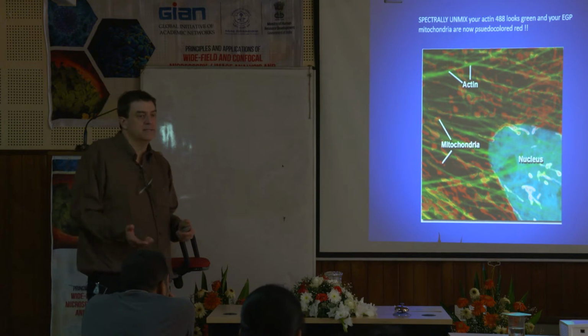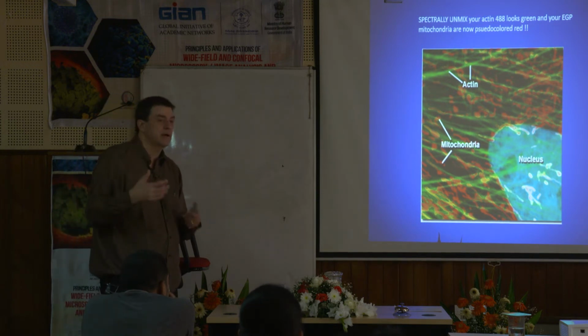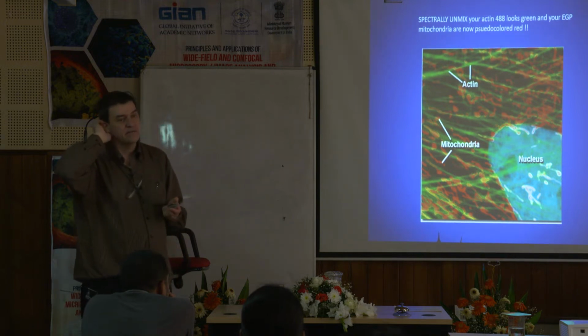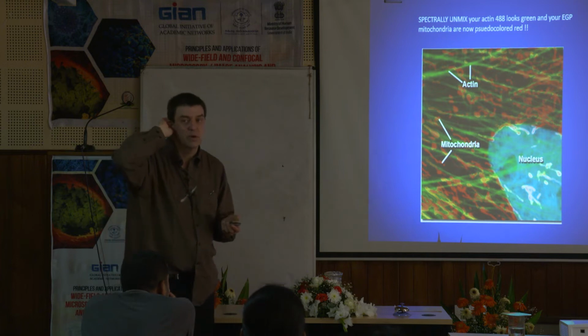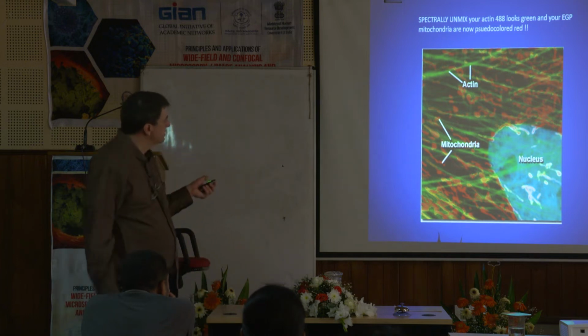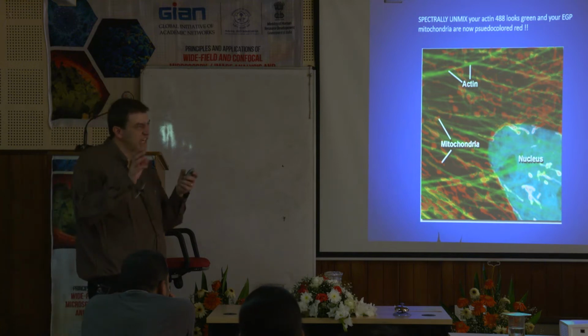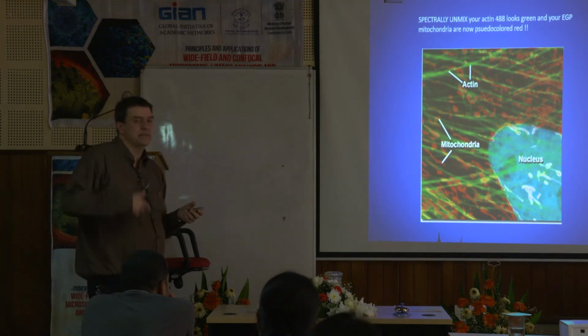So if the problem arises, especially in plants, I would think, not that I work with plants that much, but I would assume you have so much green from the chlorophyll that this might be something you want to think about in the future. Maybe find an instrument somewhere here that would be able to do this type of spectral unmixing. Okay? It's sort of a niche kind of thing, but it does happen. I just wanted you to be aware of it.